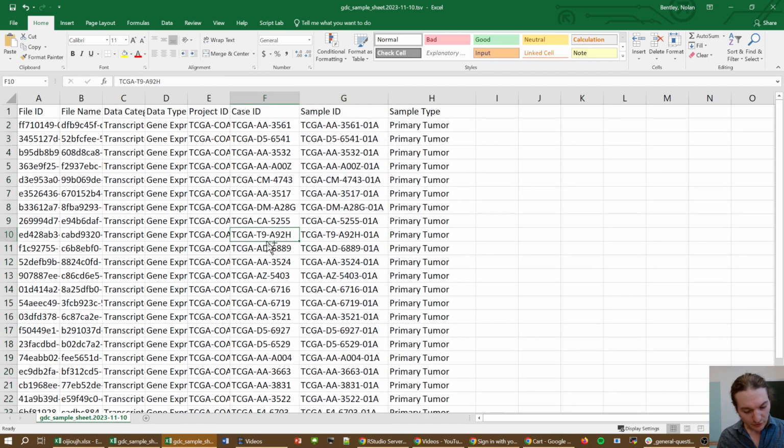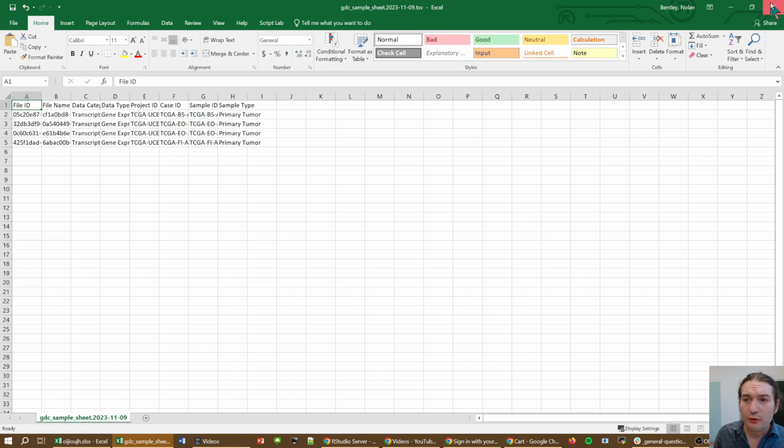And so I am going to save that, and then this would become the input for one of my grouping objects in R. So this is what I would use: read.delim, maybe read.table. Read.delim is better for these files, is what I found. I think they used to use an underscore here, but now it's a space. And so if you use read.delim, this becomes a single column, as it should be. But anyways, that's what I will do with this data in order to get the second grouping.